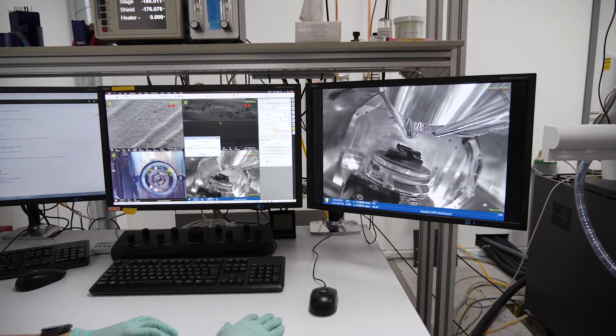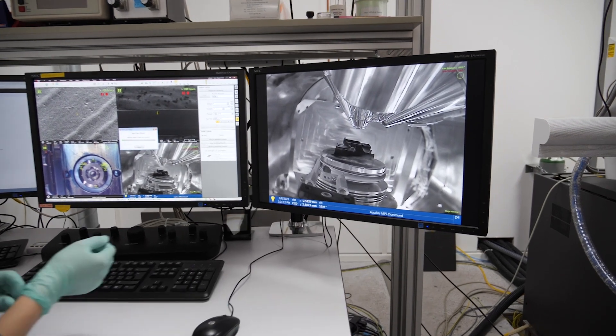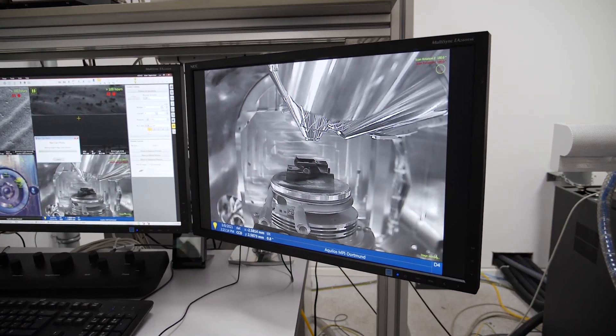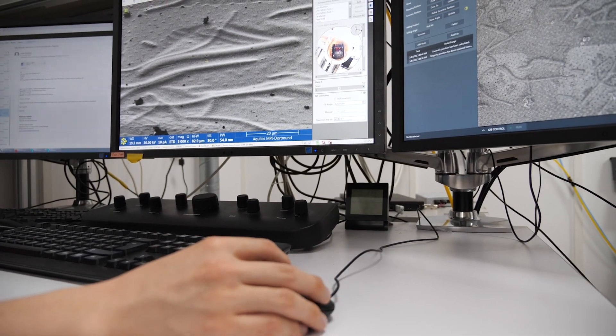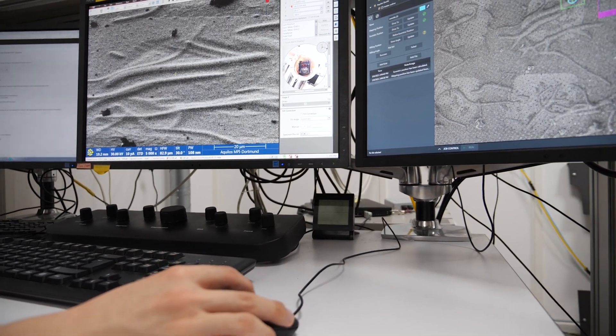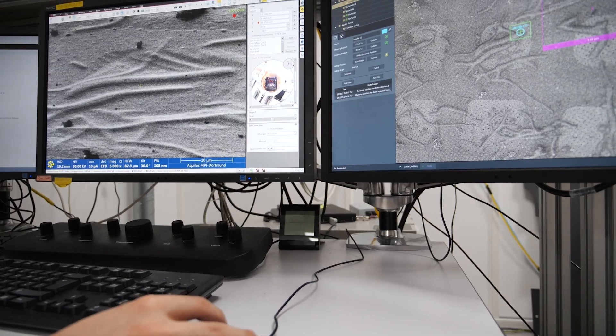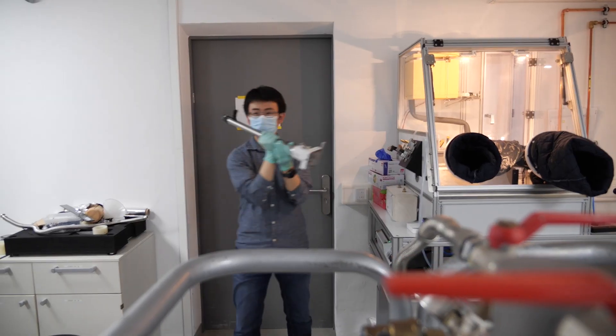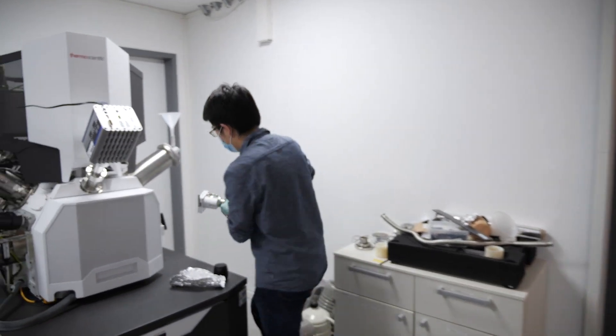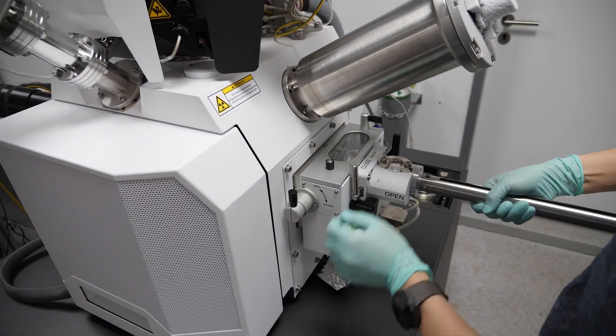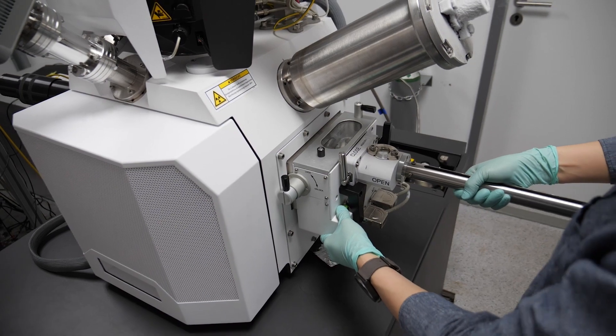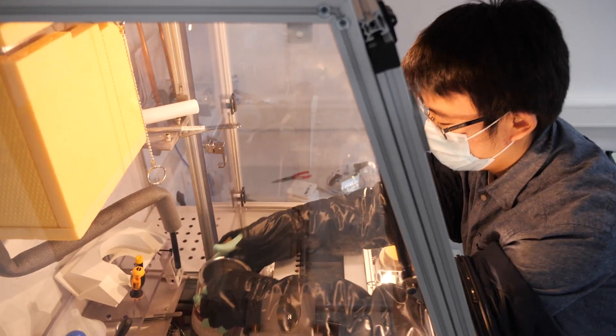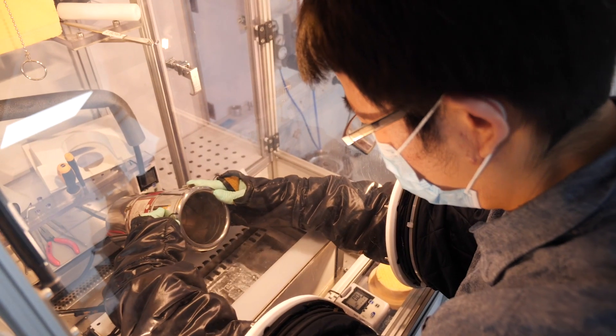The next step is to cut the sample into very thin electron transparent lamellae so that it can be imaged in a transmission electron microscope. This is done by a new technique called cryo-focused ion beam milling or FIB milling. First we need to transfer the grids into the Aquilos cryo-FIB microscope. In order to reduce the ice contamination during transfer, in our lab we have developed a special glove box where the humidity is kept at a minimum level.